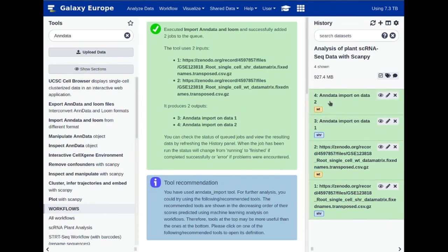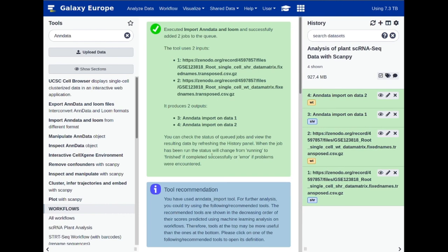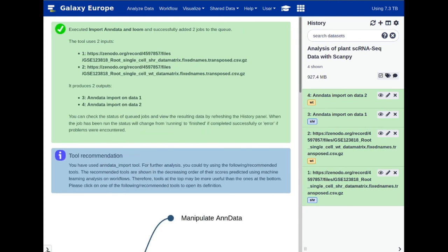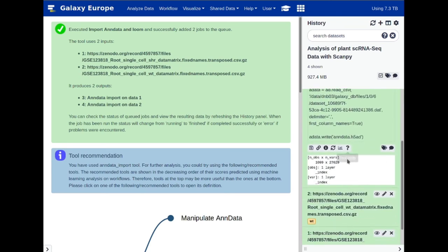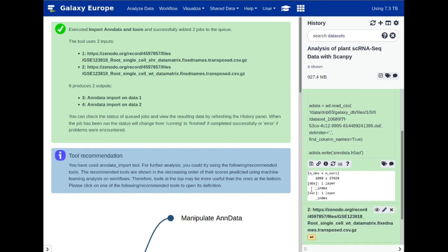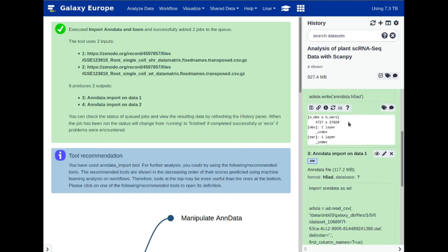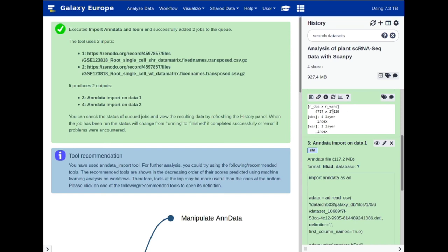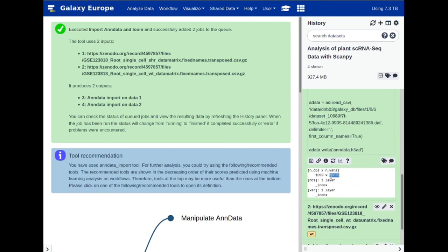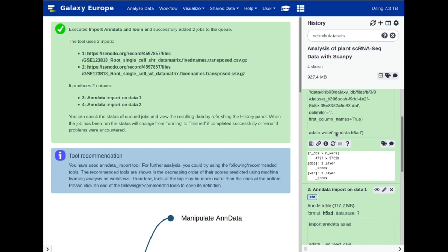Now that enough time has passed, we can see these are green. Let's minimize the sidebar. We can look at each individual dataset by clicking on the preview window. The short root dataset has 1,099 observations — in single cell, that means 1,099 cells — and we have around 27,000 variables, which is the number of genes in the raw input matrix. Comparing that with the wild type, we see 4,000 cells with the exact same number of genes as the short root.